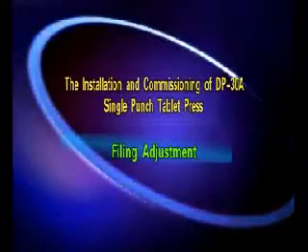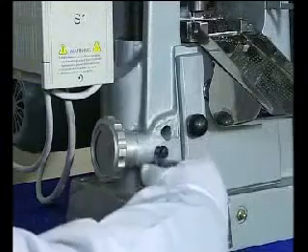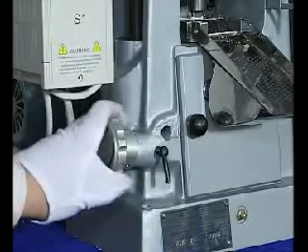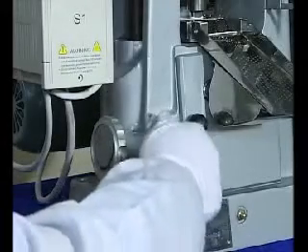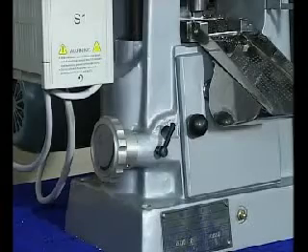Filling adjustment. Loosen the filling fixing handle. Turn the filling hand wheel clockwise to increase the filling quantity, which increases the weight of the tablet. Turn counter-clockwise to reduce the filling quantity, making the tablet lighter. Once the adjustment is completed, lock the fixing handle.